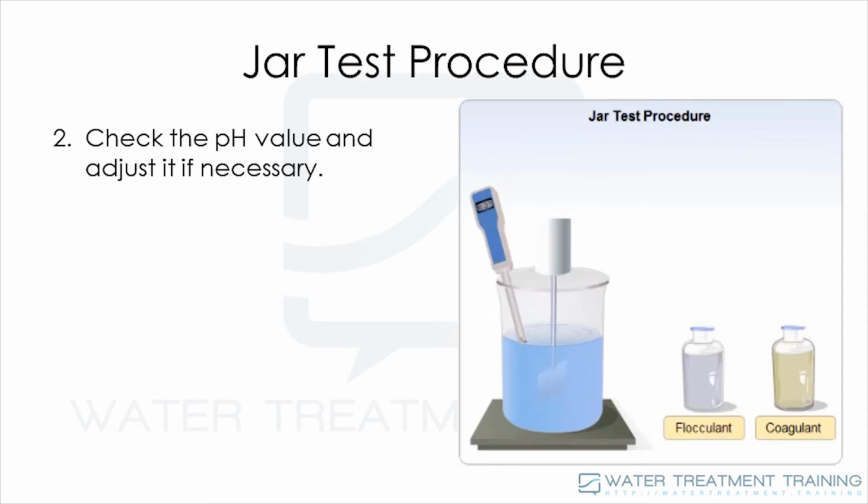Some inorganic coagulants can lower the water pH significantly. In such cases, the water pH should be adjusted higher such that the final pH will fall within the desired range after coagulant addition. For practical purposes, the amount of caustic agent needed for pH adjustment can be predetermined by separate titration test with coagulant added.